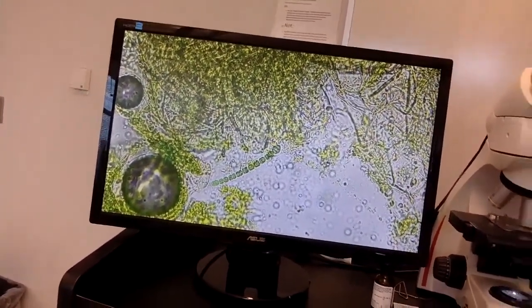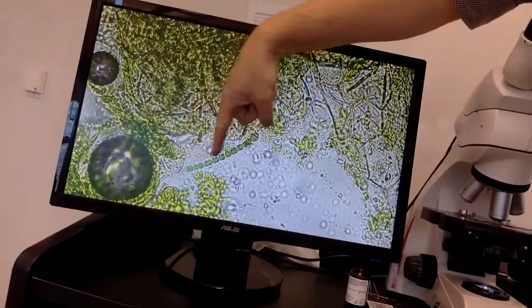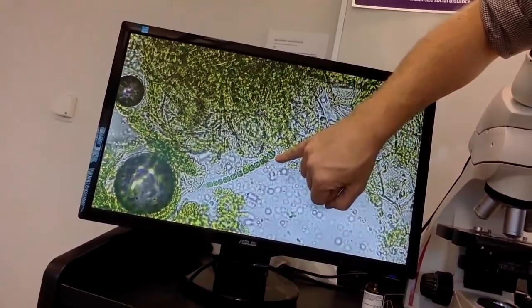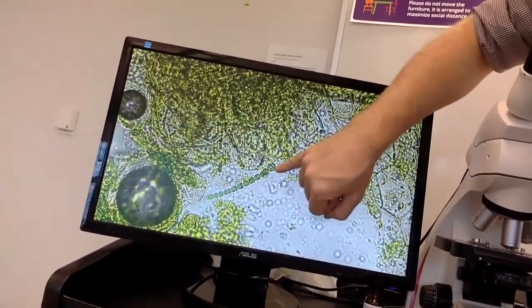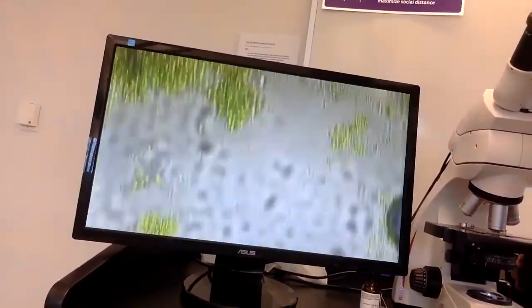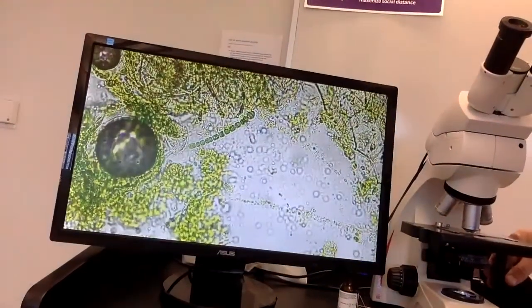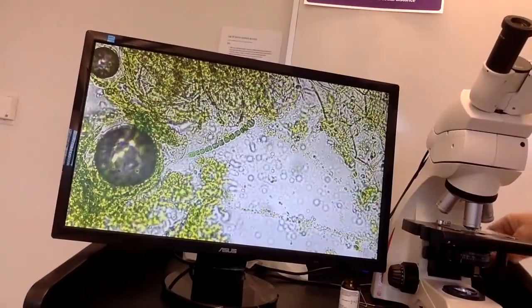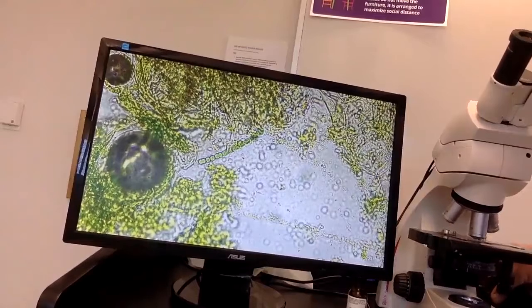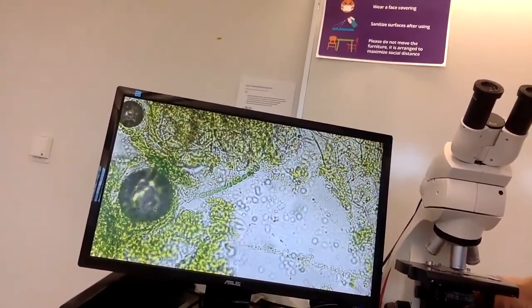All right. So this little bit down here, these are the cyanobacteria. And I might try to find some better looking ones. That kind of looks like a heterocyst to me. But it being on the end of this, I'm not quite sure. All right, I'm going to maybe leave it at that for now. Yeah, that looks a lot like a heterocyst. So bigger, rounder.